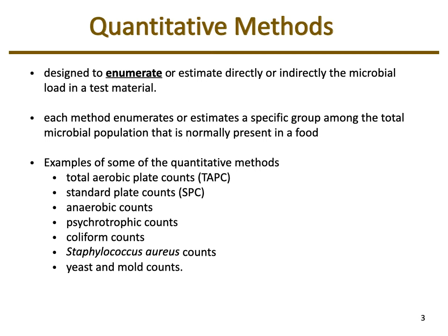And then we can also have yeast and mold counts. So different media needs to be used if you're growing yeast and molds, because in many cases, plates that are used to grow bacteria actually have antifungal components to them, like cycloheximide or several other different chemicals can be added to the plate to inhibit the growth of fungi. So again, you would have to use other types of media in order to grow the yeast or molds for counts.